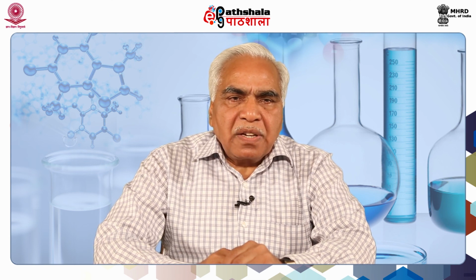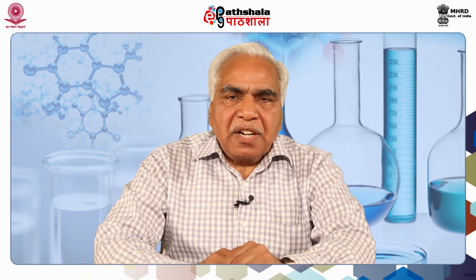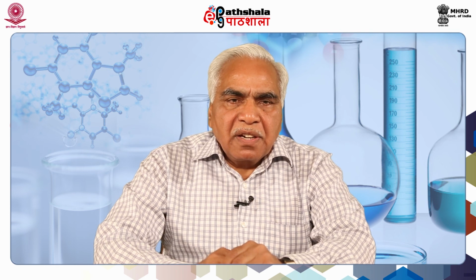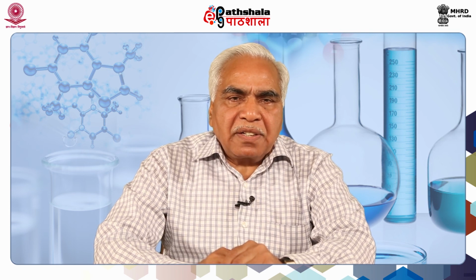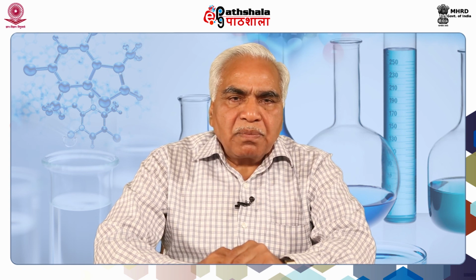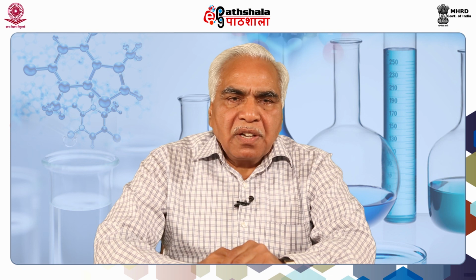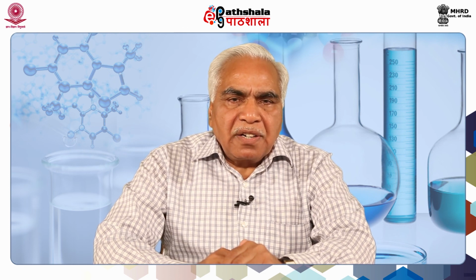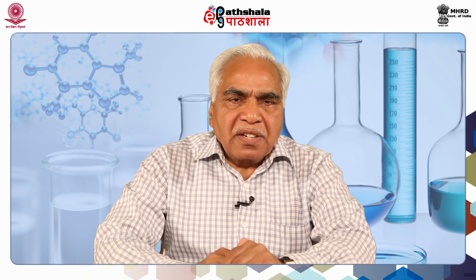Scanning electron microscopy provides three-dimensional image of object at higher magnification. Images are available at nanoscale. High magnification is derived from use of electron instead of photon for visualization. Metals are not subjected to sample preparation methods, while non-metals require coating with conducting materials before analysis.